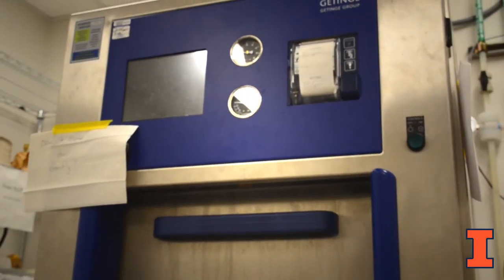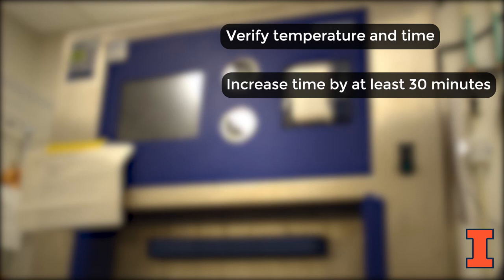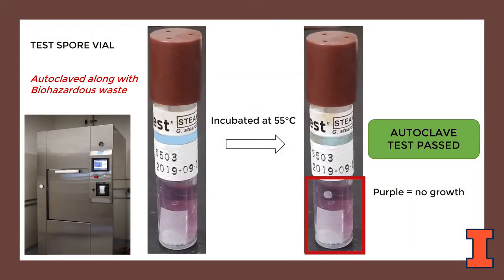To troubleshoot a failed autoclave validation test, check the recorder chart from the autoclave to ensure that the correct temperature and cycle time were reached during the cycle. If they were reached, then proceed by altering one or more parameters when you re-autoclave. Most often a small change in parameters like an increase in cycle time can be an effective solution. Other changes that have often been found effective are adding half a cup of water to dry waste loads, altering your loading technique, and positioning of your bag in the autoclave. After completing the autoclave cycle, repeat the spore vial check until you have verified that the vial has passed the test. Use the newly optimized parameters for future autoclave cycles on similar loads.